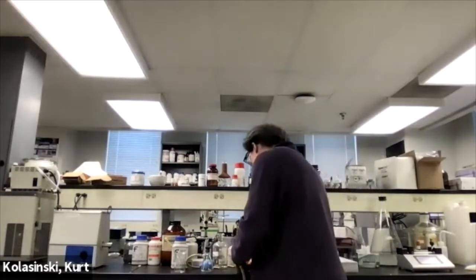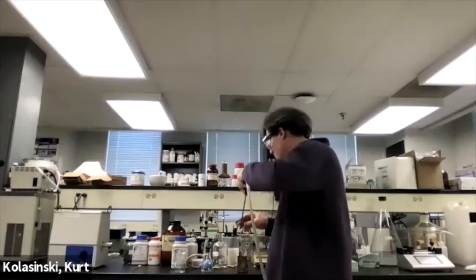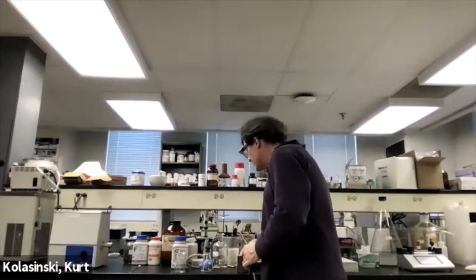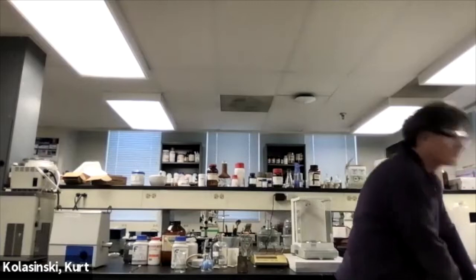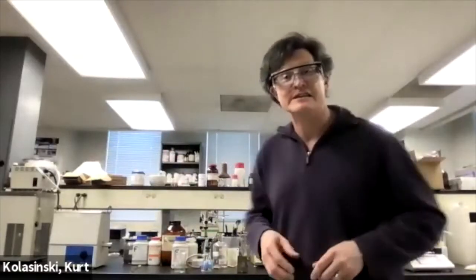So I'm just going to open up these two valves. All right, so you have to open them both so that the argon flows through there, and then just run some argon through, run it through the other side as well, run it through there again, and make sure to close those off. And we know then that our cell is, at least as much as practical for this application, devoid of CO2 and water. So now I'm going to go off and run a background spectrum. I'll show you how to do that in a moment. Okay, now I'm back.